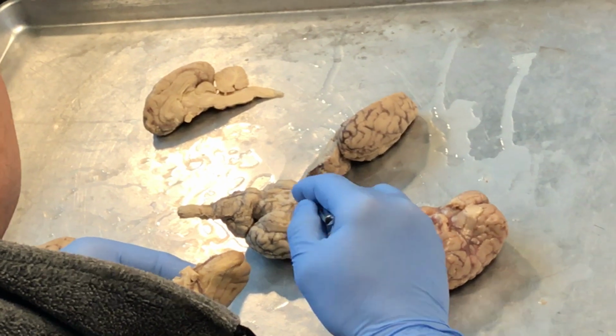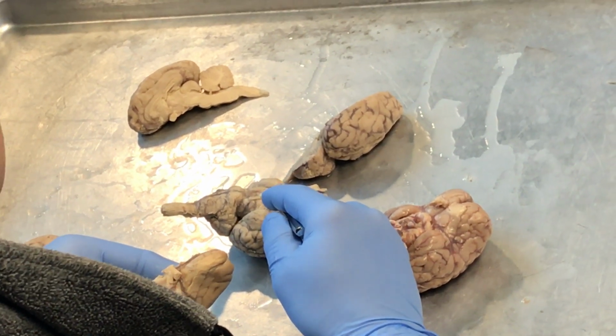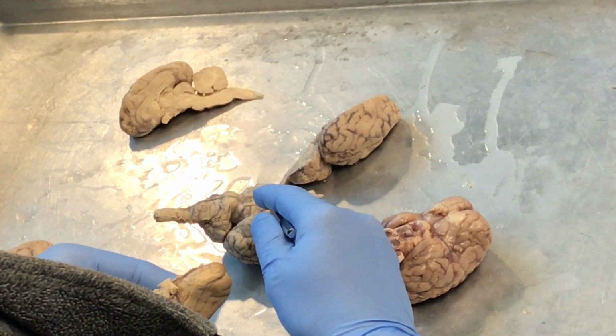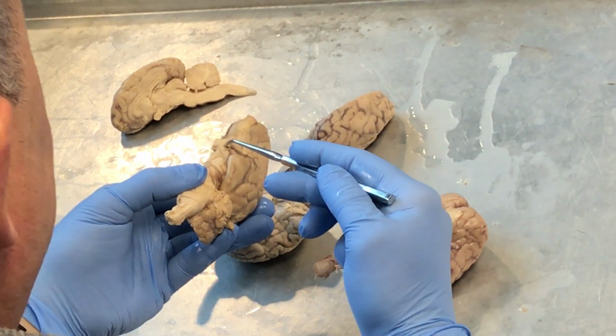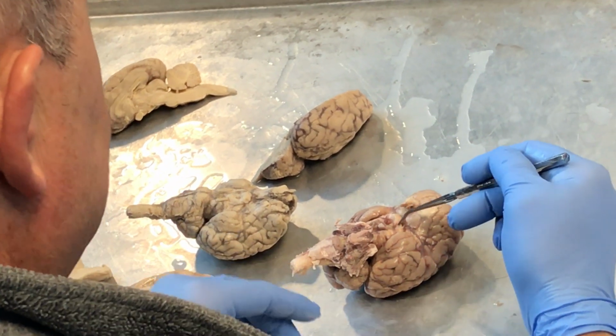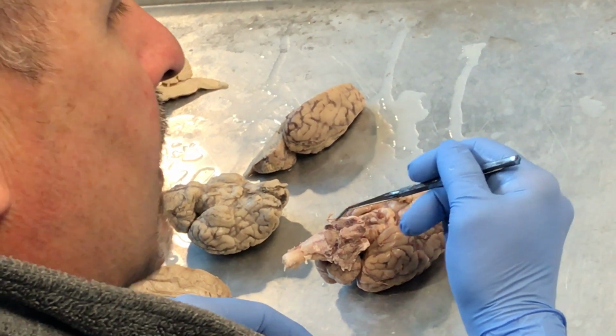So optic nerve, optic chiasm in the middle, across the X, and then this is going to be the optic tract back here and optic tract back there. Optic tract here, optic tract right there.